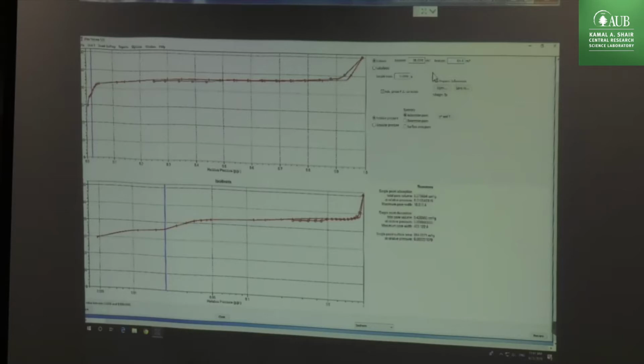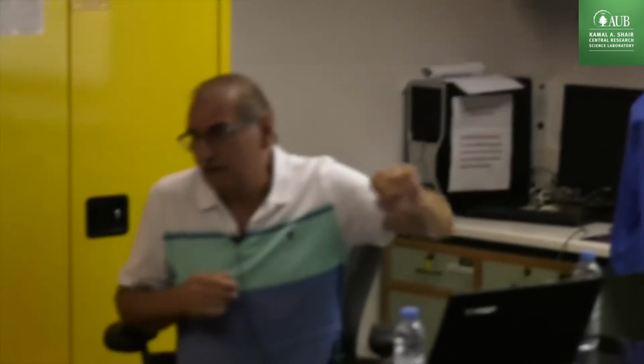If I was able to do it, it means it was my free space, and the free space is directly related to the purity of the helium. As I said, if you go from 99.99 to 99.999, it's 3 times more expensive. Also for us at Micromeritics, and I have the people who do the gases just in front of me.